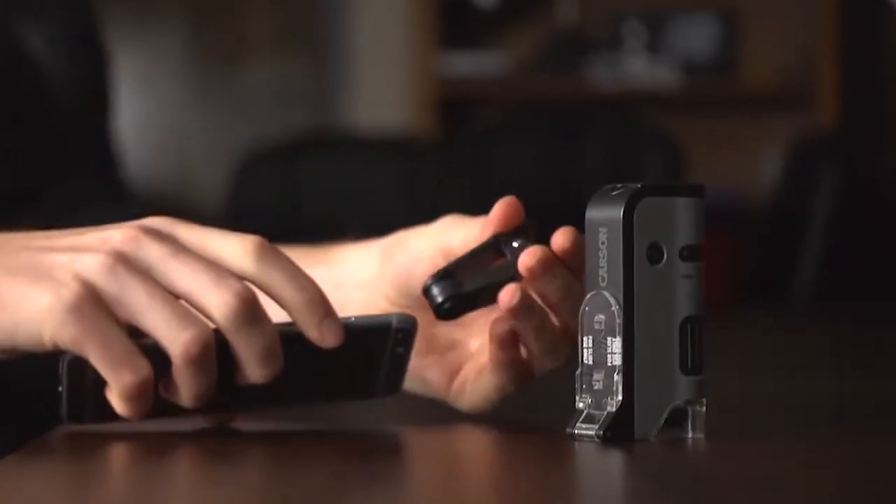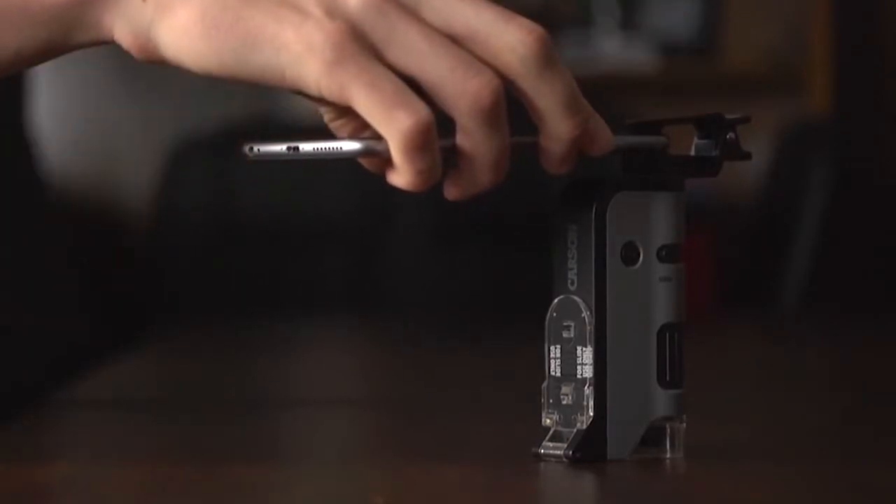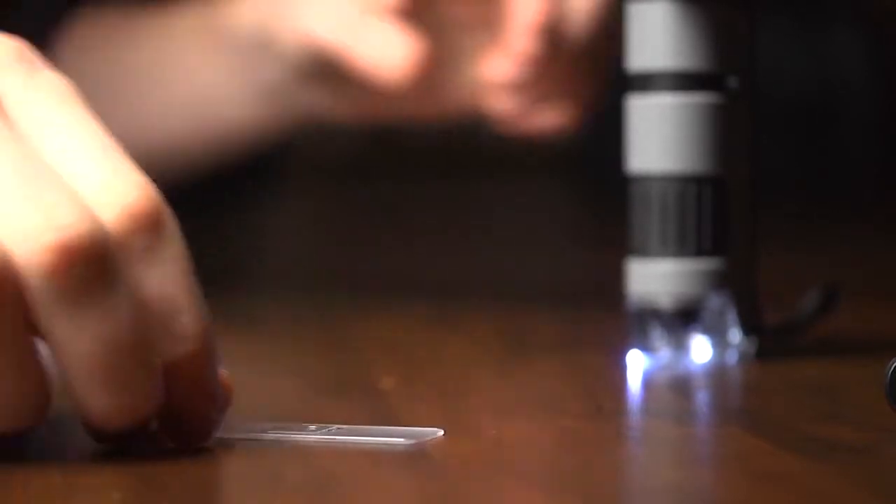Included with the MicroFlip is an adapter that attaches to your smartphone and allows you to take photos and videos of your research. When preparing your own slides, it's a good idea to use a cover slip to get better results.